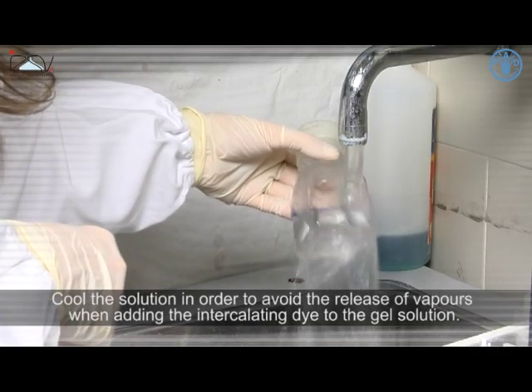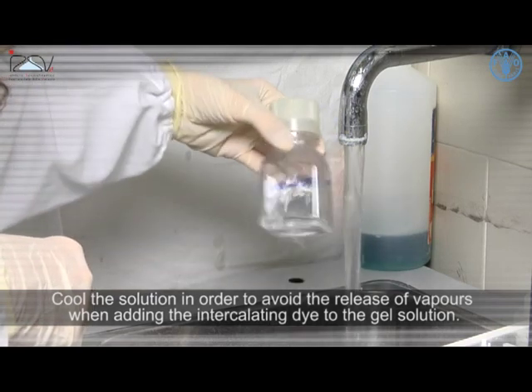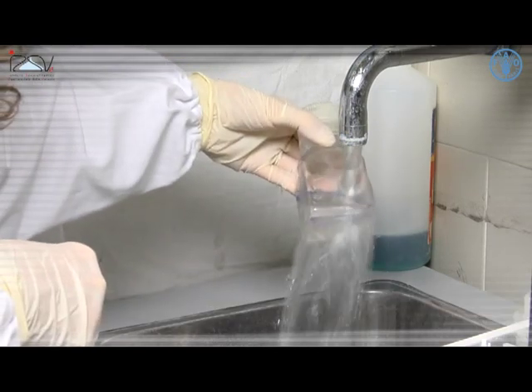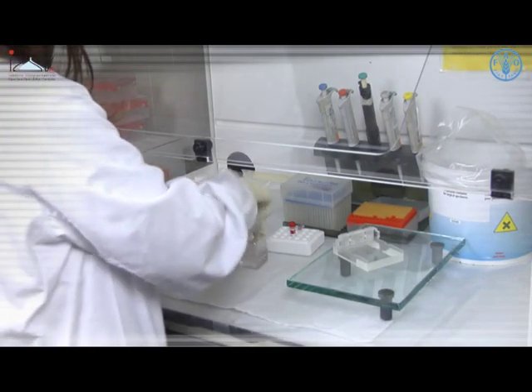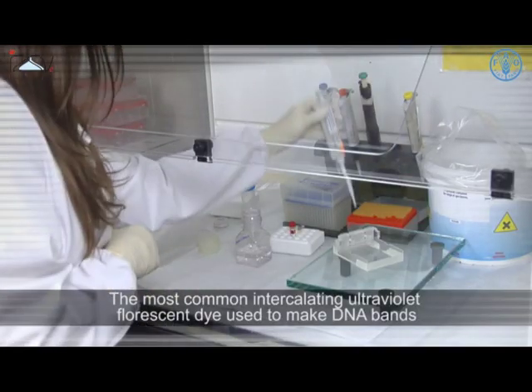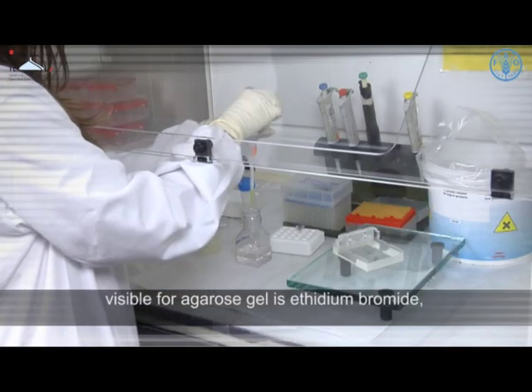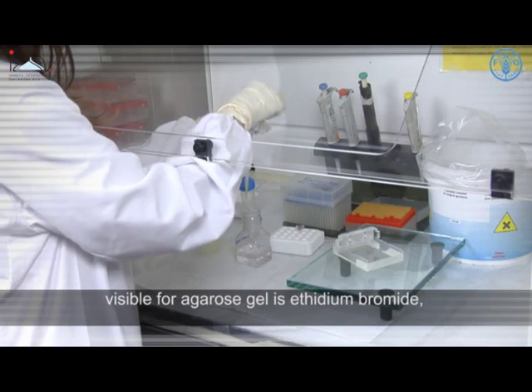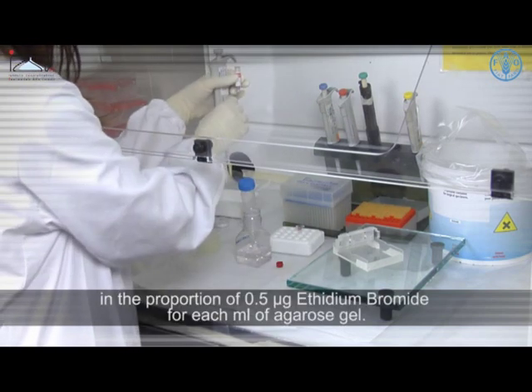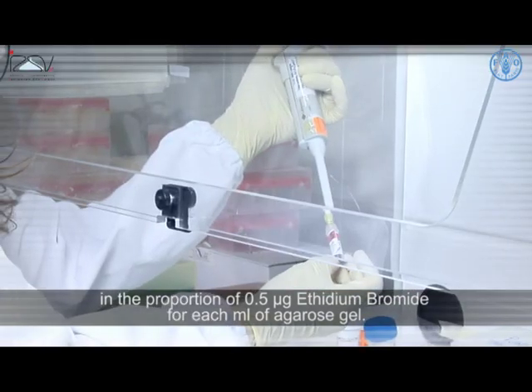Cool the solution in order to avoid the release of vapors when adding the intercalating dye to the gel solution. The most common intercalating ultraviolet fluorescent dye used to make DNA bands visible for agarose gels is ethidium bromide, in the proportion of 0.5 micrograms of ethidium bromide for each milliliter of agarose gel.